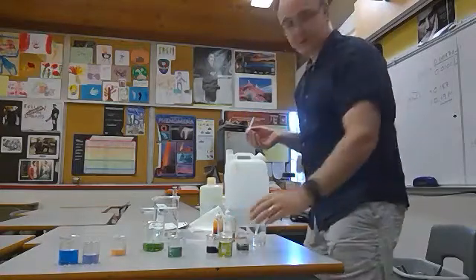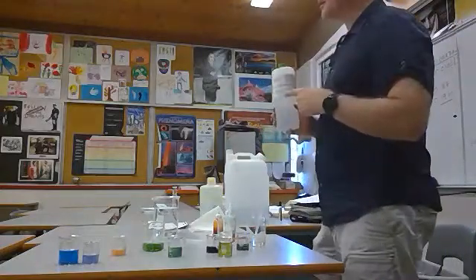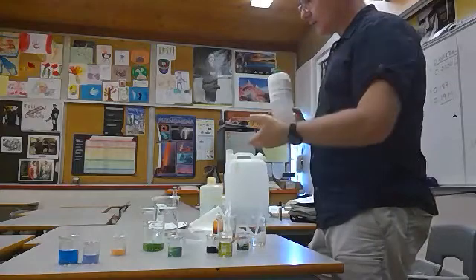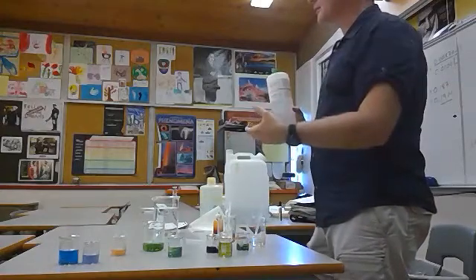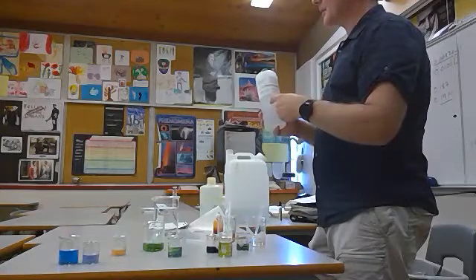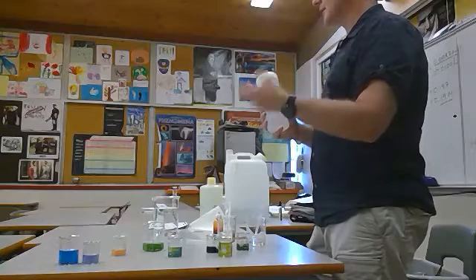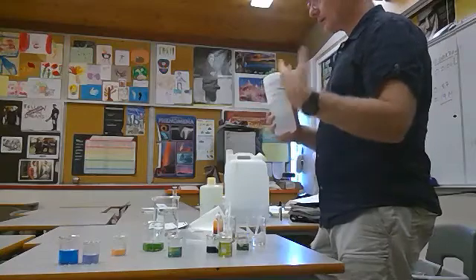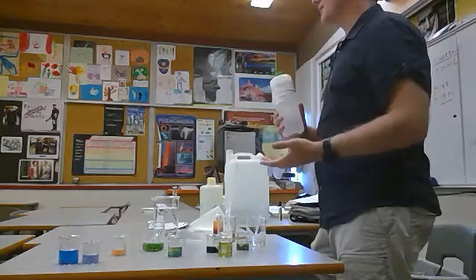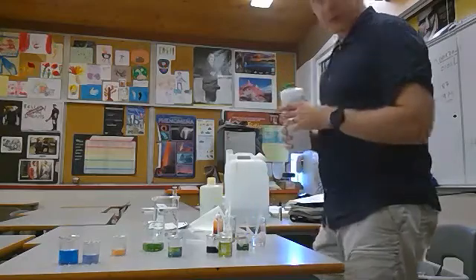So in this tube here, we have a weak acid and a weak base. And so depending which chemical you add to it, that other chemical neutralizes it. So if I add a base to this, it's the acid in here that neutralizes that base. So once you run out of that chemical, though, you can't stop the pH from changing. That's why it went dramatically in those cases. So I'm just going to stop the video there. That's probably good enough for that.